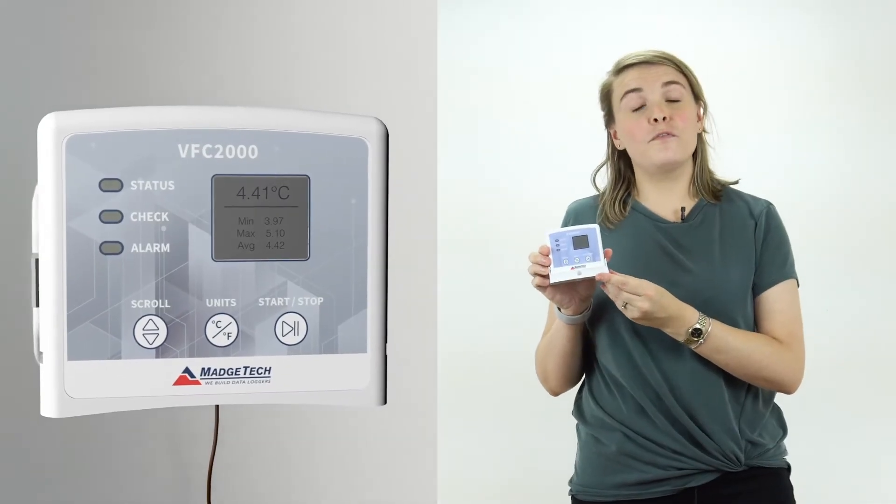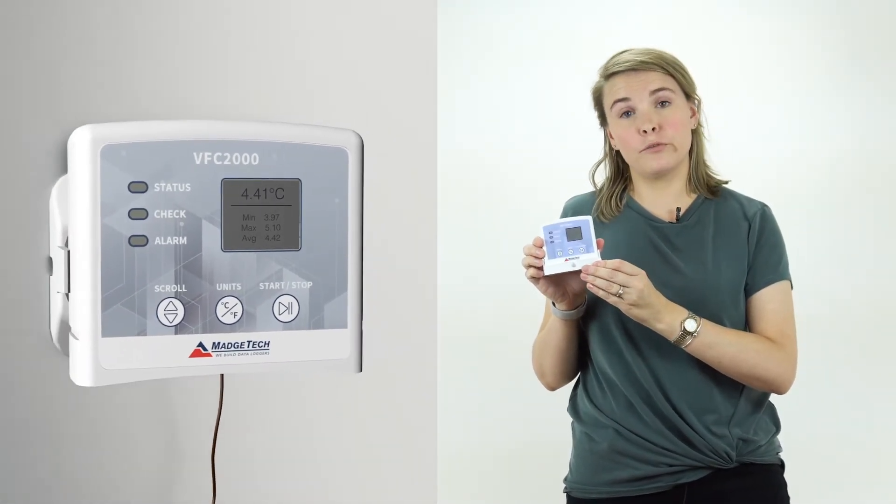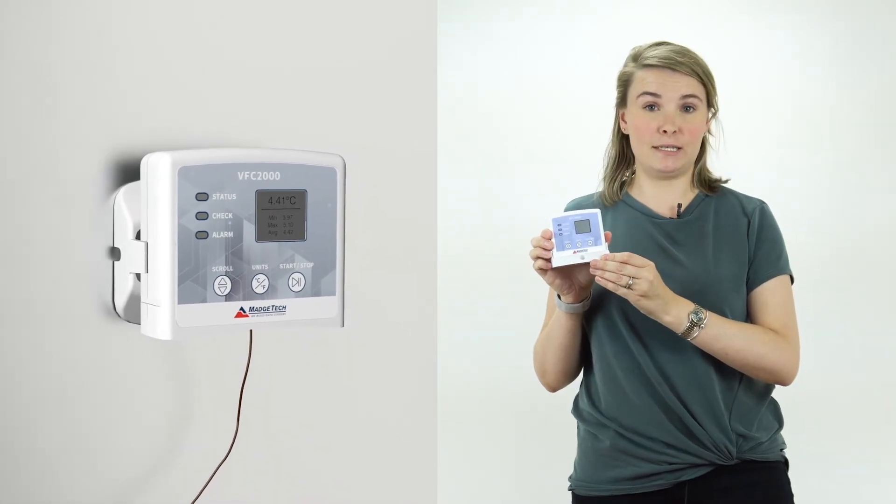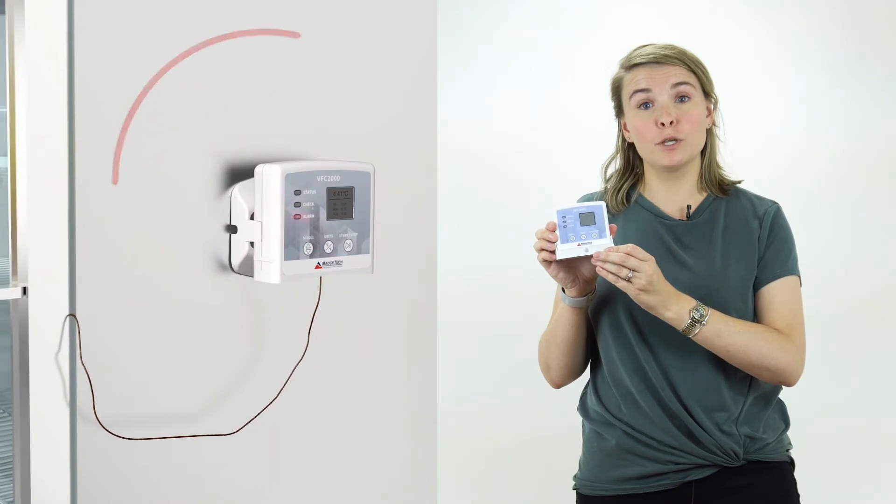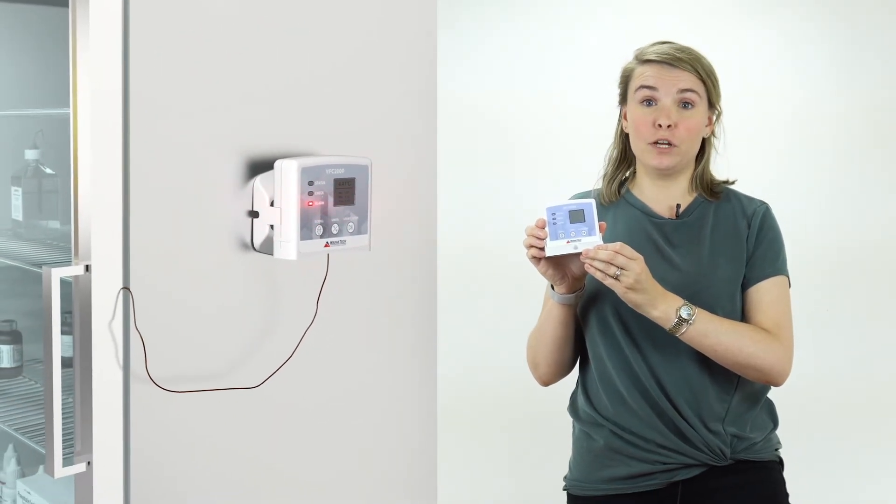The data logger itself features an LCD screen which shows current readings as well as minimum, maximum, and average statistics. The device is also equipped with user-programmable alarms which can alert you if there is an out-of-range reading.